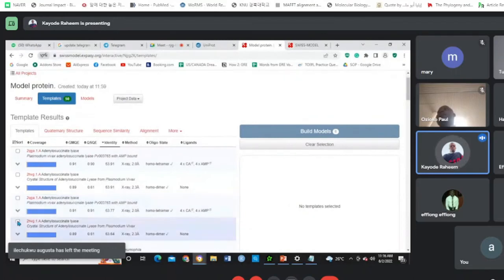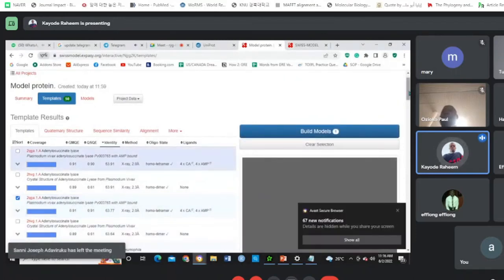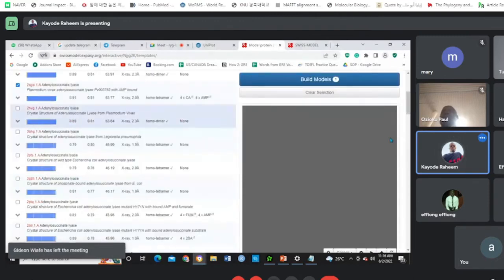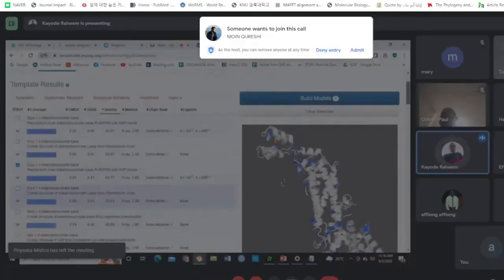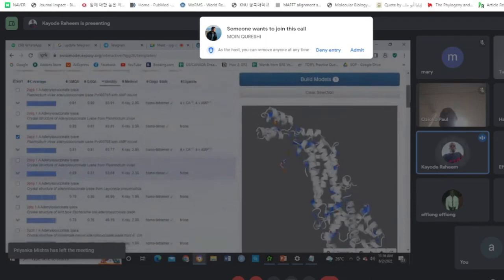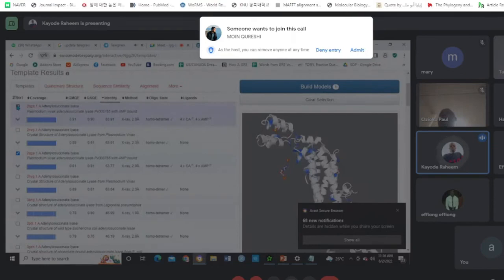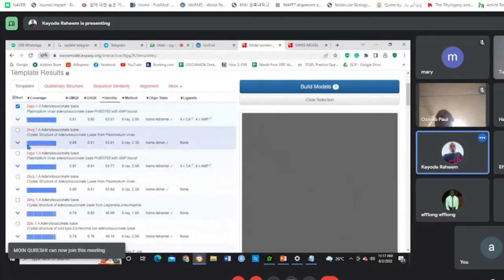So if I click on the next one here, allow it to load to show up. Sorry, my network is a bit slow. So it will show up here. That's fine, good. They are different ones entirely. So if you click on 2, it will build it together. It will bring the 2 that you select, 2 templates at once, but I advise you to work on one template, so as not to confuse yourself. So let's work with the first one.